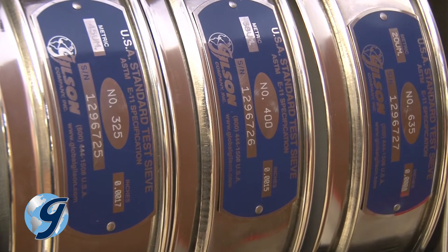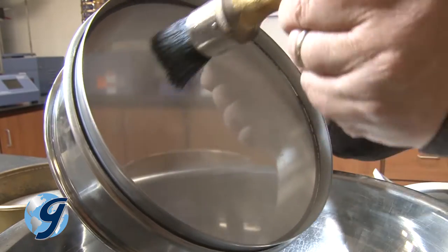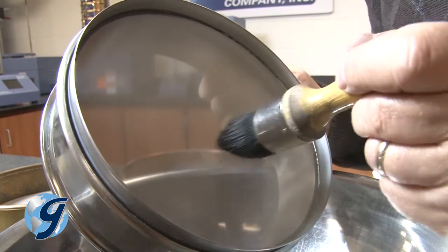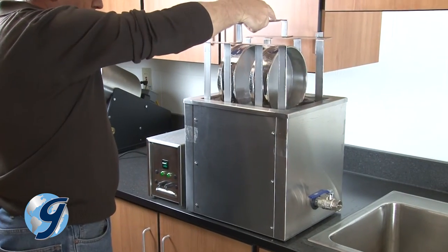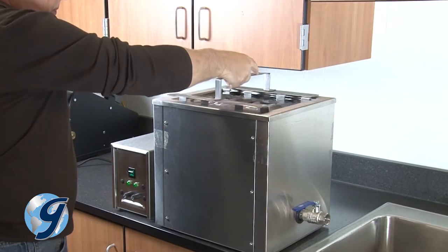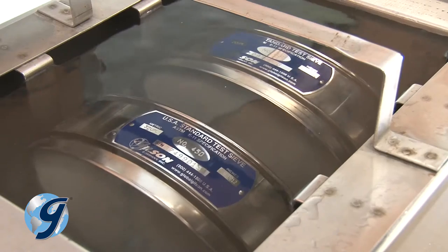For sieves finer than number 325, using a soft bristled brush is possible. But to create a better cleaning process and help with dislodging difficult materials within the sieve openings, immersing these finer mesh sieves in an ultrasonic cleaner with a water and mild detergent solution is recommended.